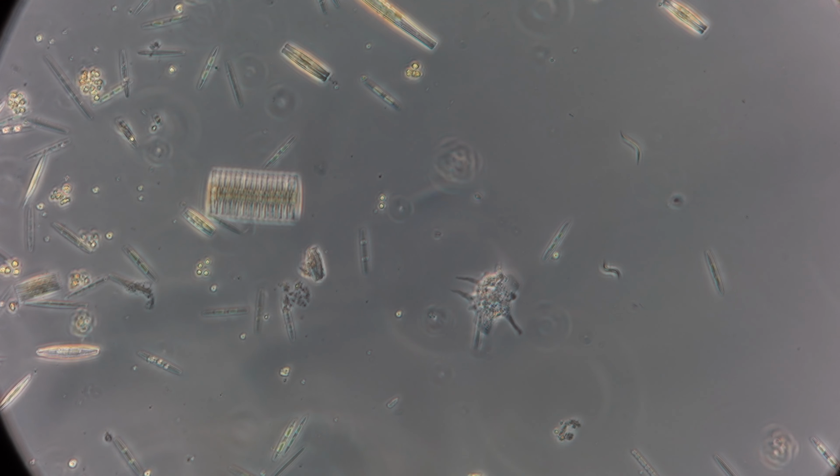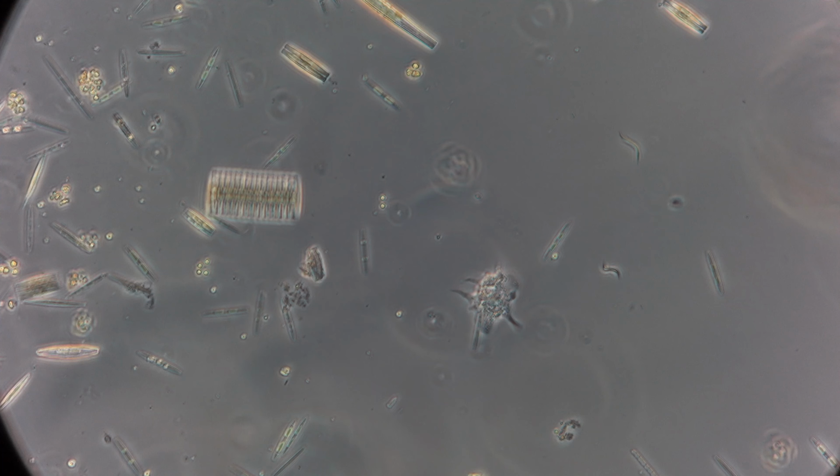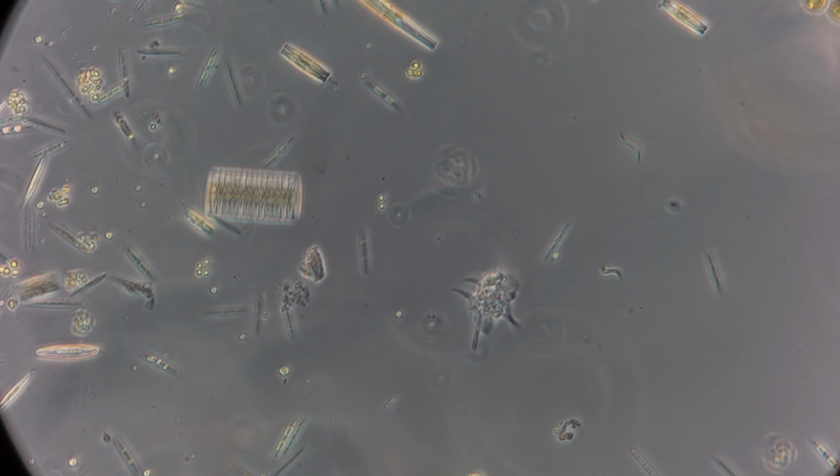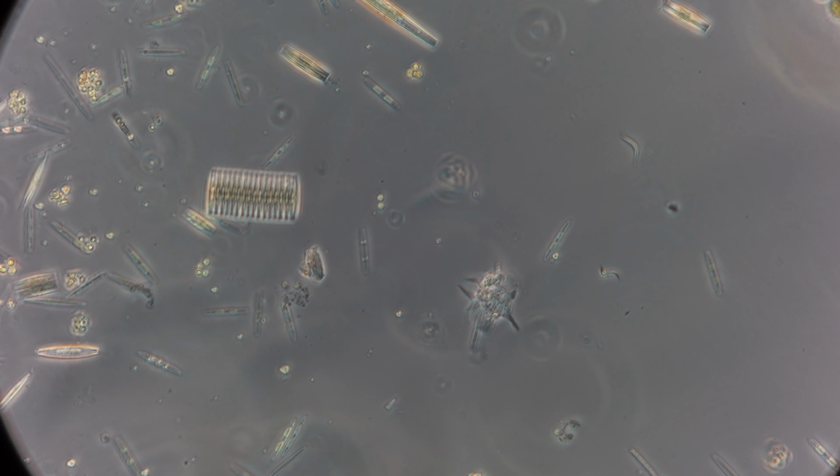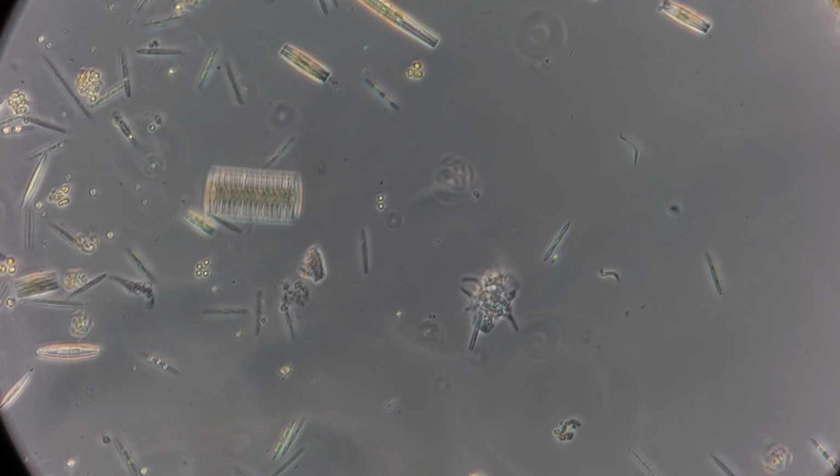So is that like pseudopods? It's like extensions of the cell membrane. That's how it moves around. And this one will slowly move too, but it's going to take a while, so I might get bored with it. But you can see all the stuff inside of it. I love amoebas, but you really have to be really, really patient and just record them for a long time. But let's keep moving.